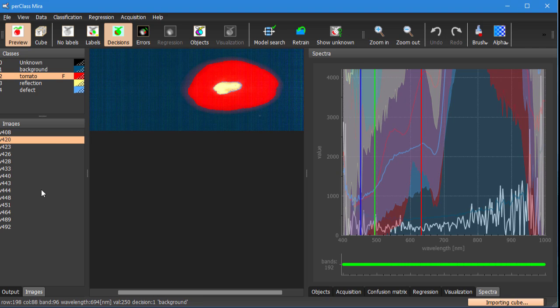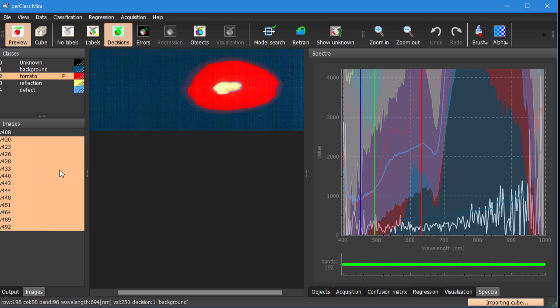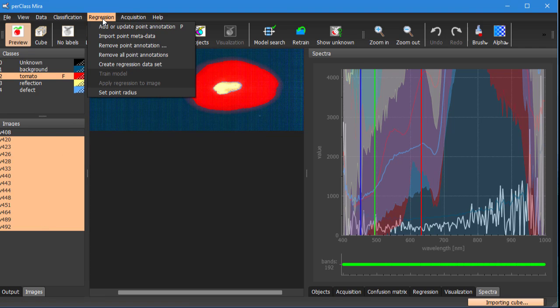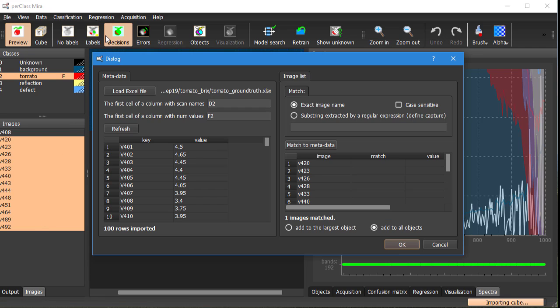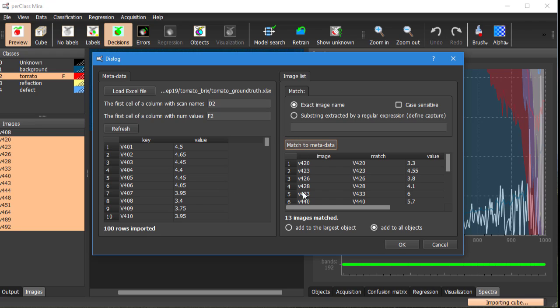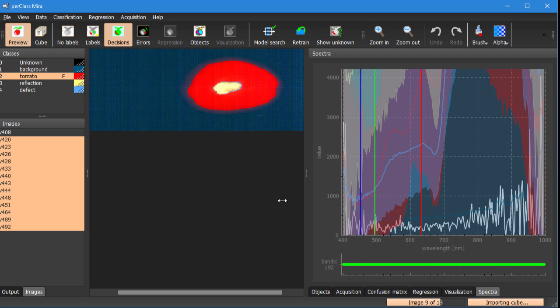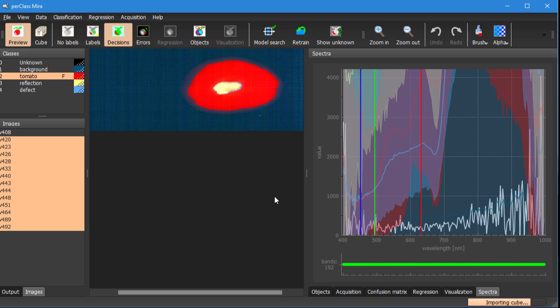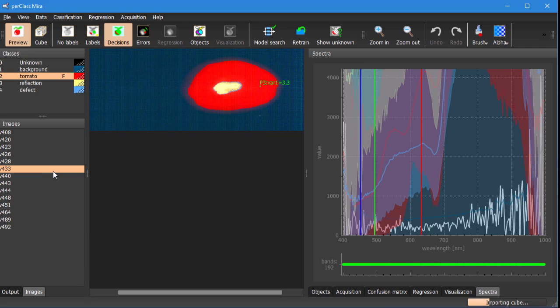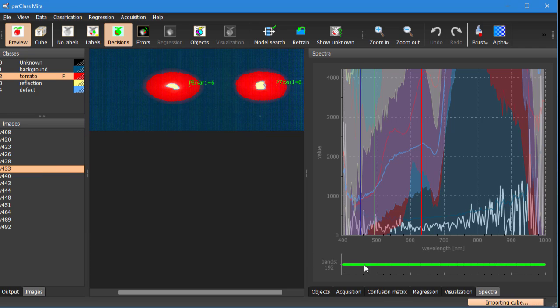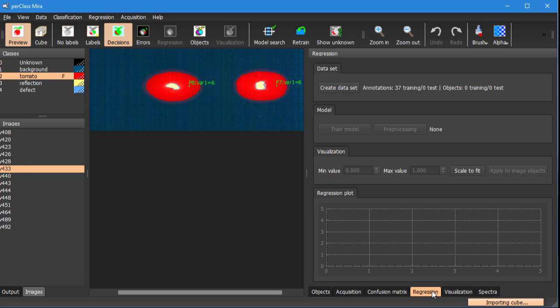So we can repeat this process for a set of scans just returning to the import dialog that remembers all the settings, matching the information and importing the numerical metadata. This will provide us with annotated set of scans and we can progress towards the regression analysis.